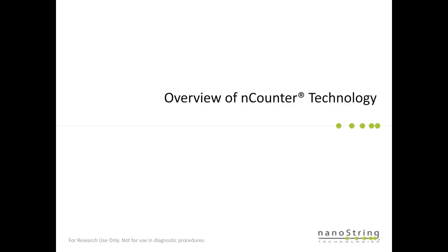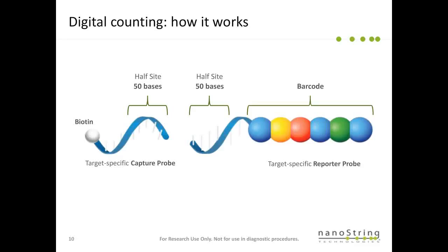So first, before I get into the real data, I want to give a very short, brief introduction about the nCounter technology. This is a digital hybridization-based technology to count target molecules actually one by one. So it's purely digital.